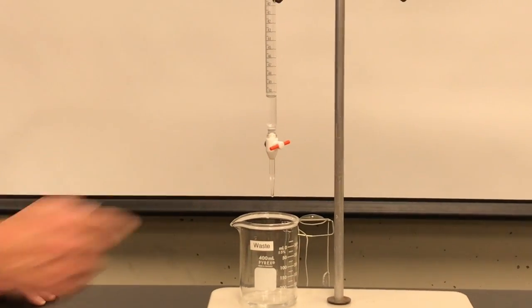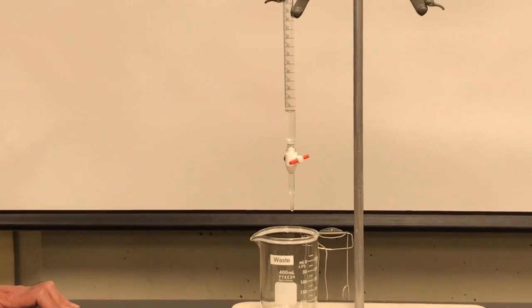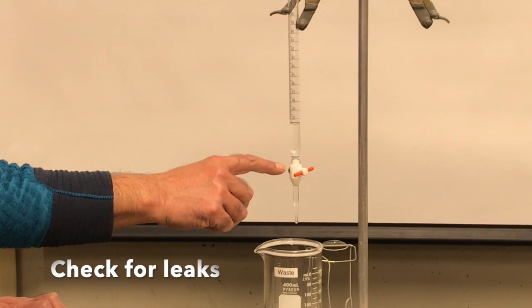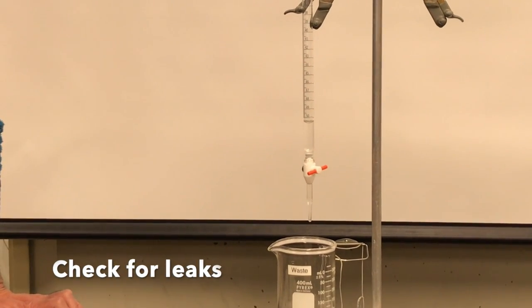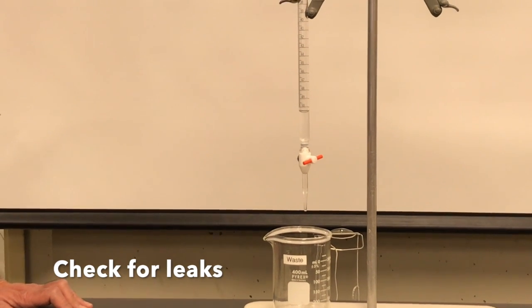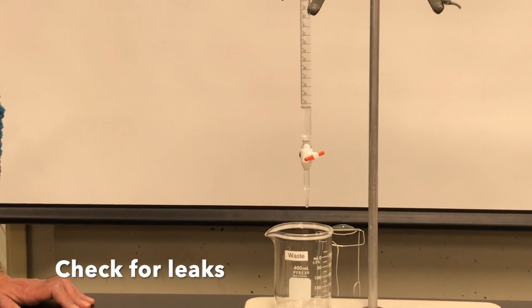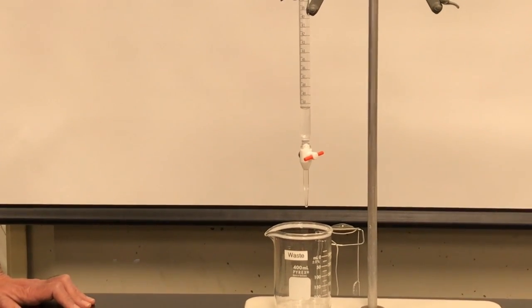Once you fill the tip of the burette with liquid, it's a good idea to try to keep it full from this point on. You also want to check for leaks when you're just rinsing the burette with the deionized water. If there's no leaks, you can continue rinsing. If there are leaks, make sure you let Alberto or Lydia know.